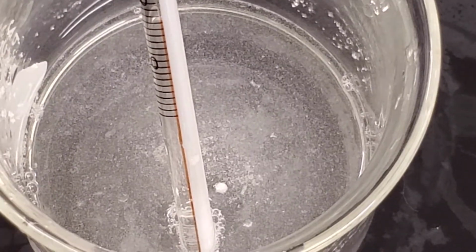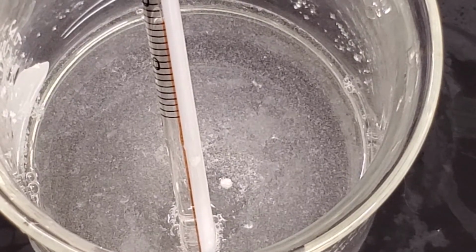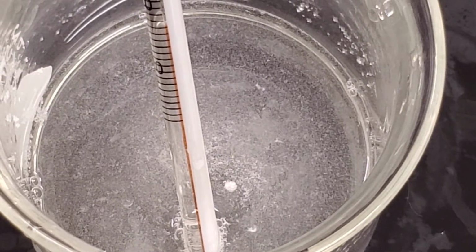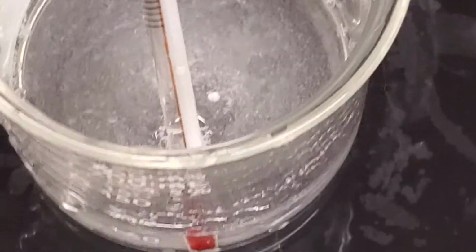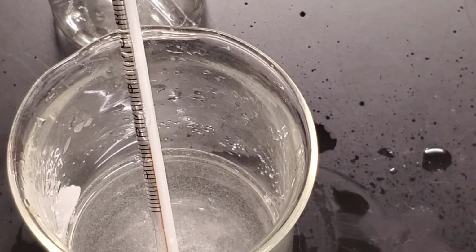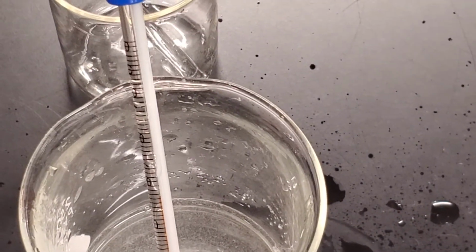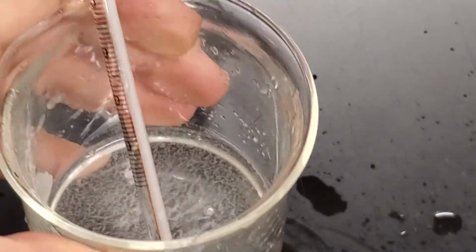So currently it looks like the liquid is mostly clear. We do see some of the powder still floating around in it, so it has not completely dissolved. So still not a lot in the way of color changes necessarily. You can see the thermometer through it.